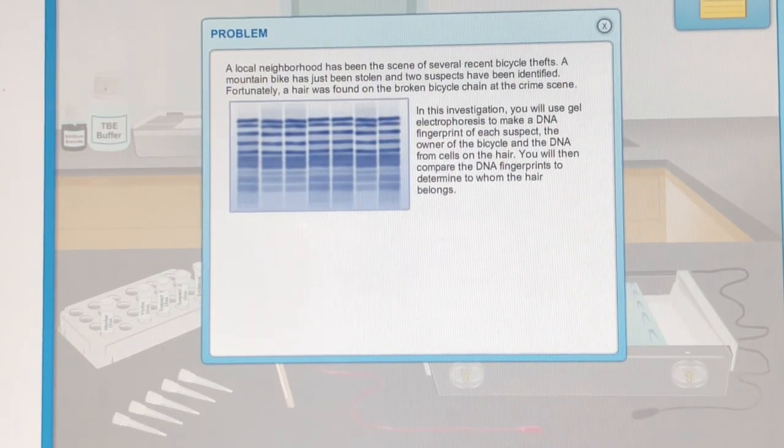A local neighborhood has been the scene of several recent bicycle thefts. A mountain bike has just been stolen and two suspects have been identified. Fortunately, a hair was found on the broken bicycle chain at the crime scene. In this investigation, you will use gel electrophoresis to make a DNA fingerprint of each suspect, the owner of the bicycle, and the DNA from cells on the hair. You will then compare the DNA fingerprints to determine to whom the hair belongs.